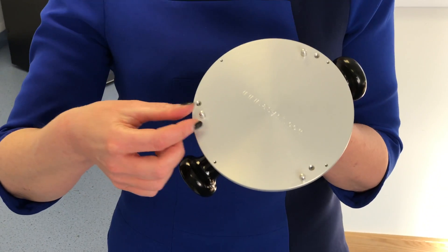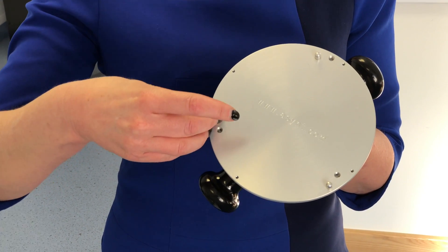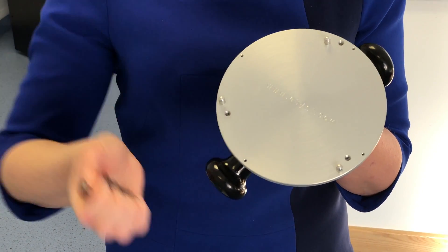It's so easy to do. You literally undo the pin and change the position of the pin depending on whether you have a round, square, or rectangular unit.